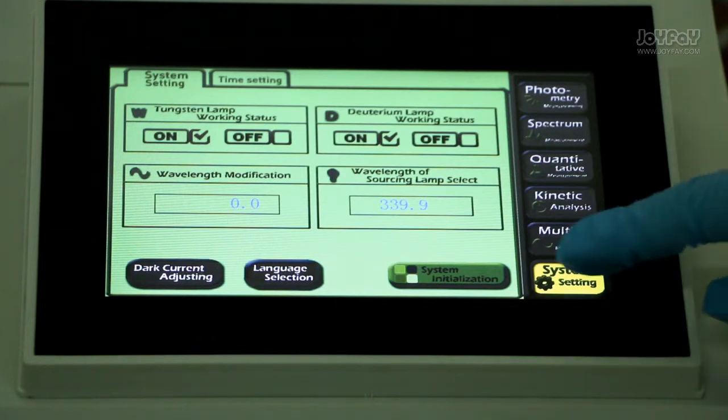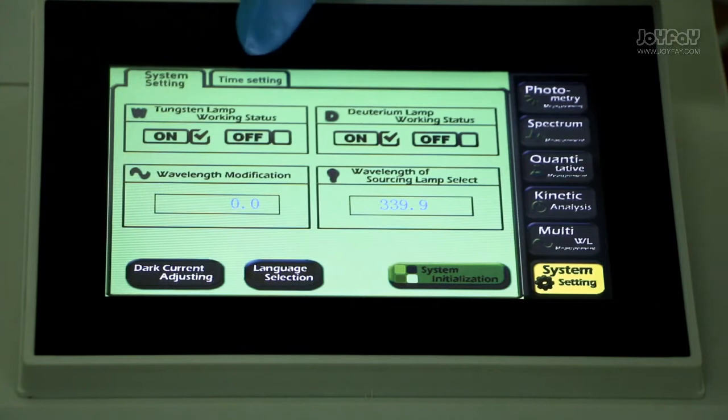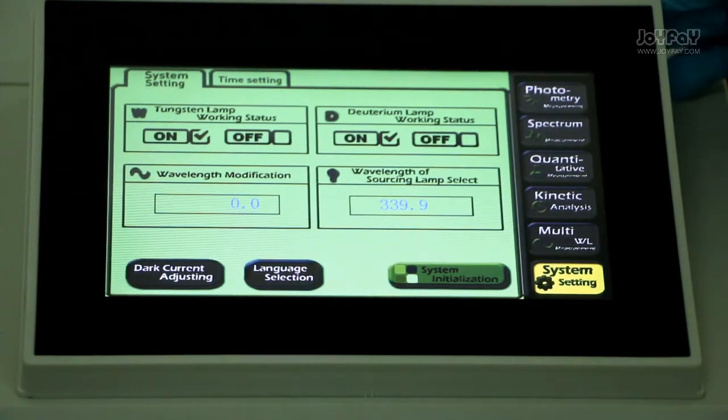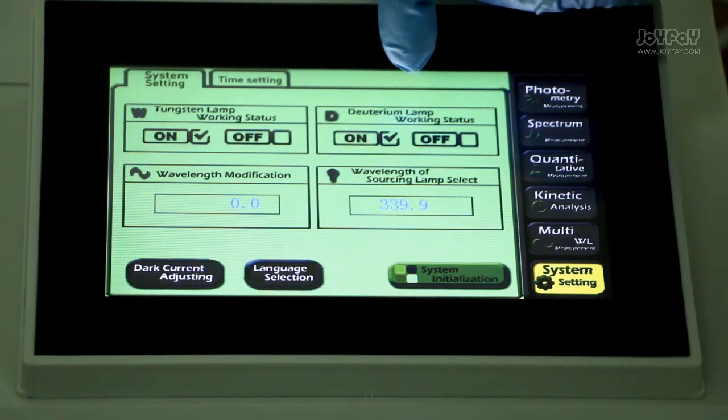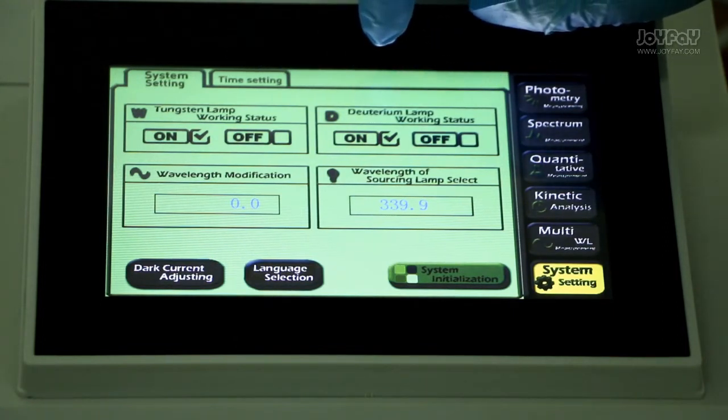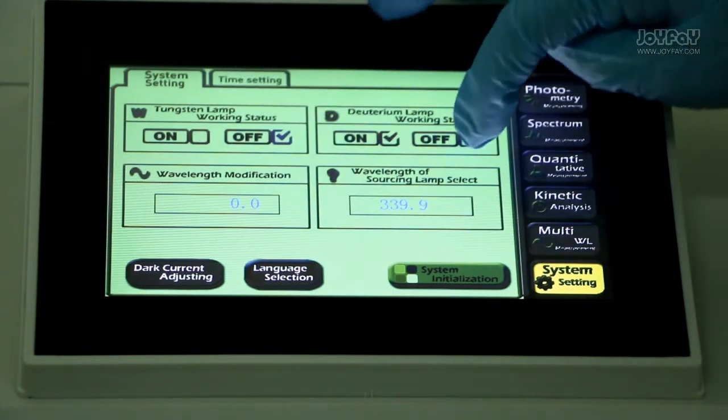We will come to system setting. Here we have two tags: system setting and time setting. Testing lamp working status, deuterium lamp working status. Press on to turn on the lamp and press off to turn off the lamp.